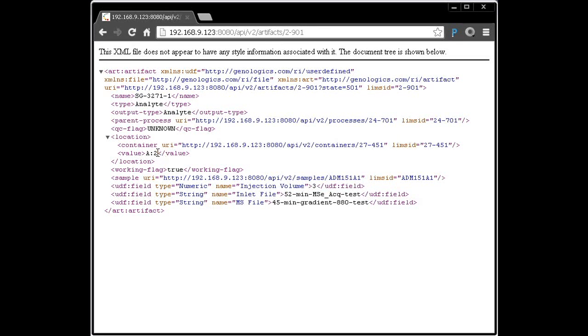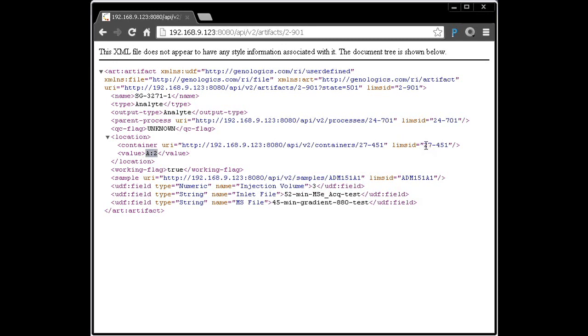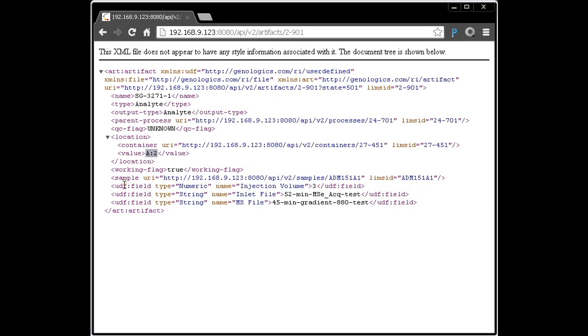Now we're seeing the XML representation of that analyte. For example, if we look at its location, we can see it's in position A2 on this container, 27451. We get to see various other information, including what the initial sample was that it was derived from, and any user-defined fields which are attached to that analyte.